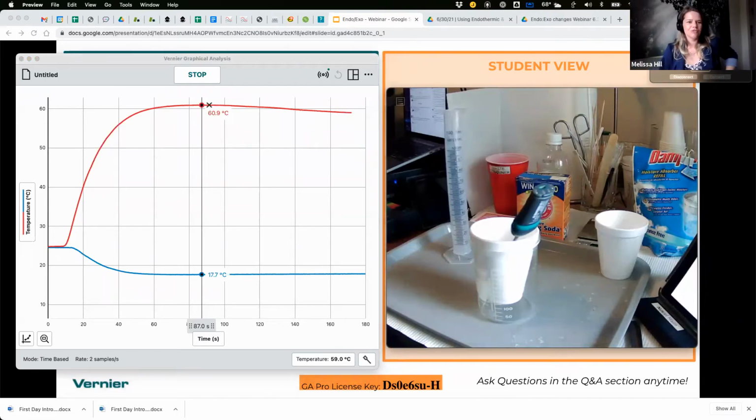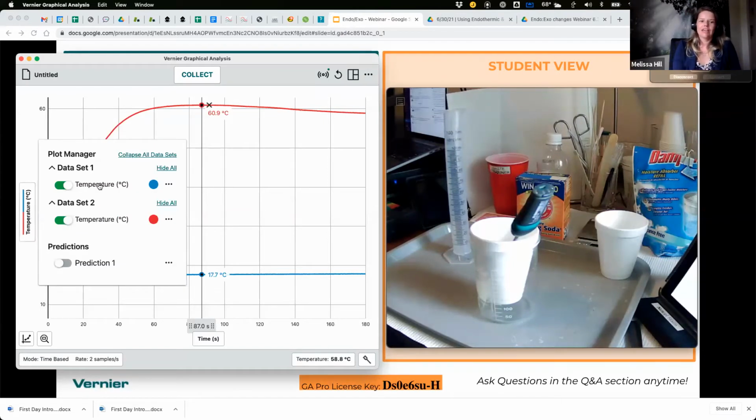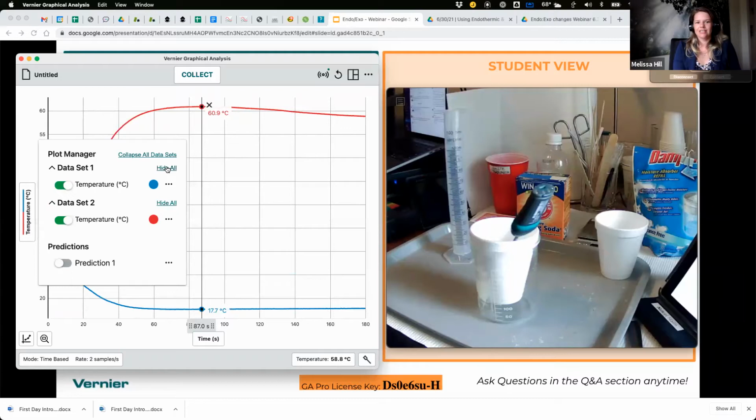So before you go too much further, we had a great question about viewing both runs simultaneously. Can you show them how, if you had wanted to do that from the start of the experiment, they would enable those runs, making sure that they know that they can just enable them at the beginning and then you could see them come in? Is that the plot all option? Yeah, you can have them click plot all, or you can just have them do the little toggle switch. So basically when you start data collection, just have them toggle that, and then they'll see the data coming in. They'll see any previous data. Yeah, that was a great question.